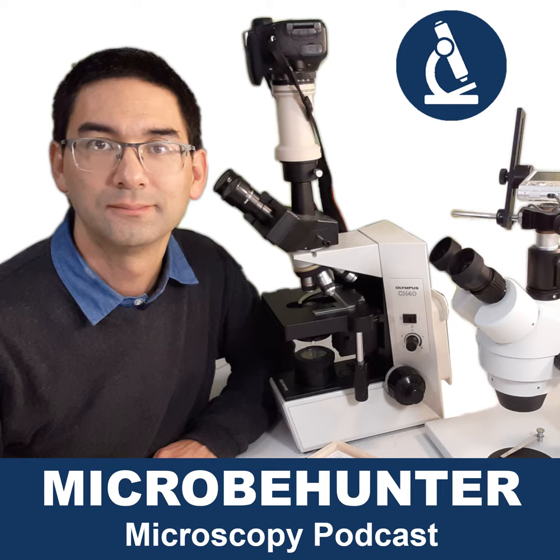What I've heard, discussed in some web forums, is that people had an infinity system from a smaller manufacturer and had real problems getting spare parts because there were simply not that many around, and because it was its own standard, it was also not interchangeable with other microscopes.